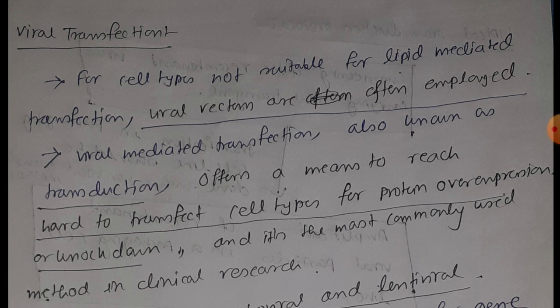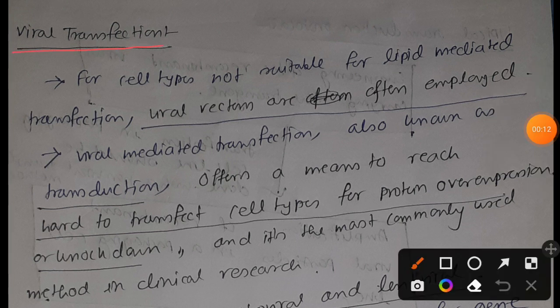From today, I will start another video lecture series where I will focus on viral transfection. This is another kind of gene delivery method that we have to discuss.